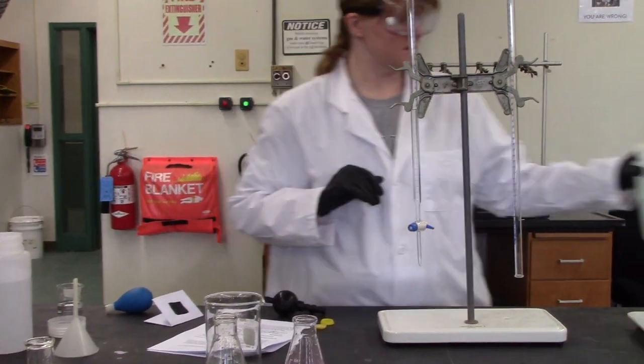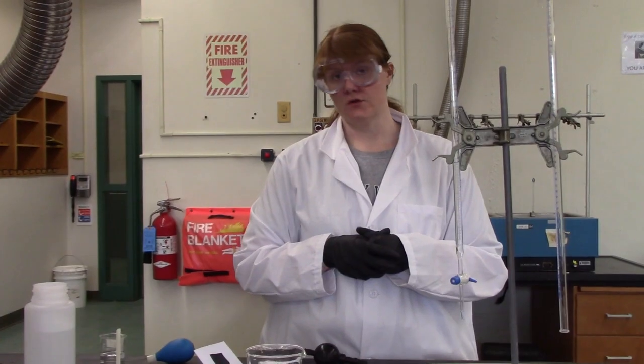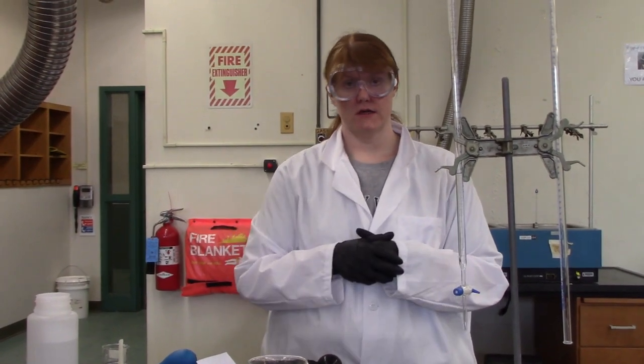So for waste today, it's super easy. Acids and bases just go in the sink. They're not hazardous once they're neutralized. And so all your containers just go in the sink.